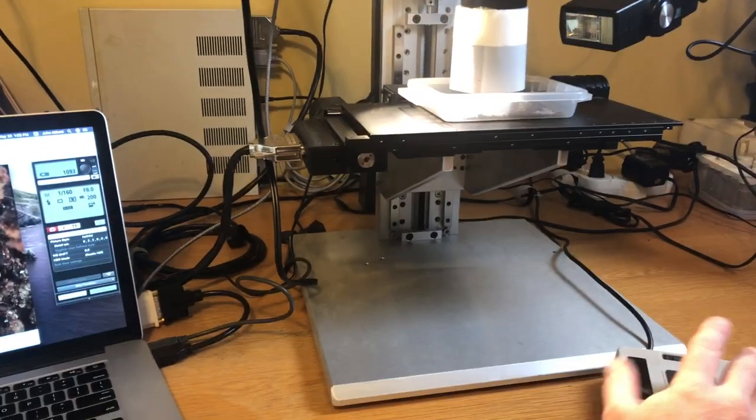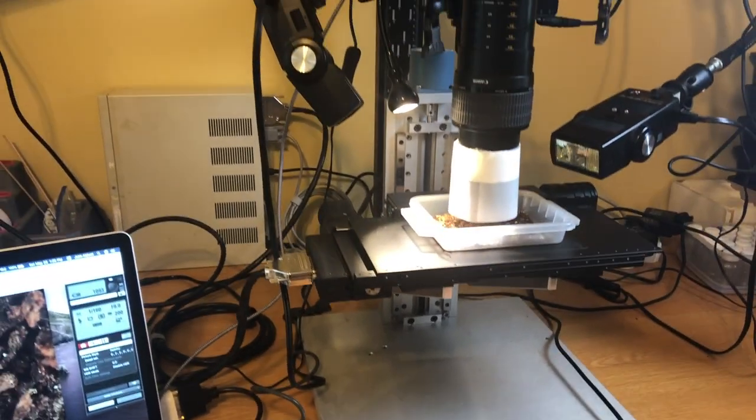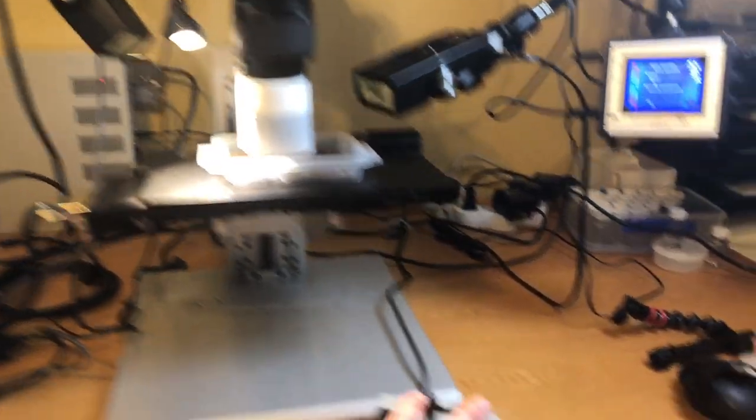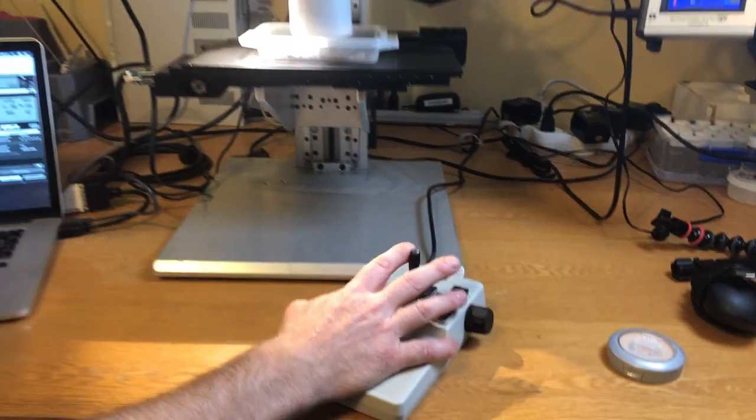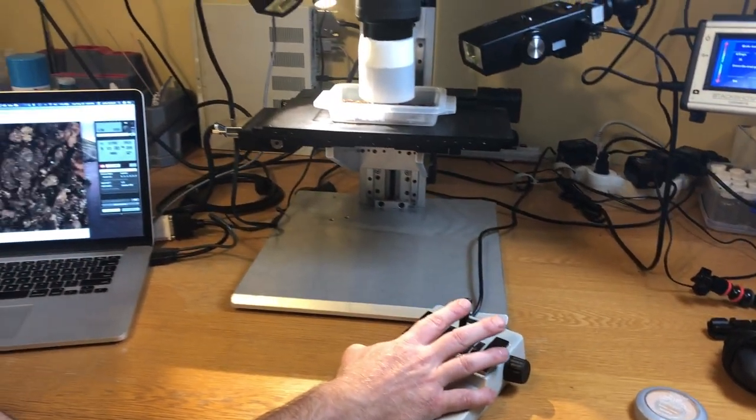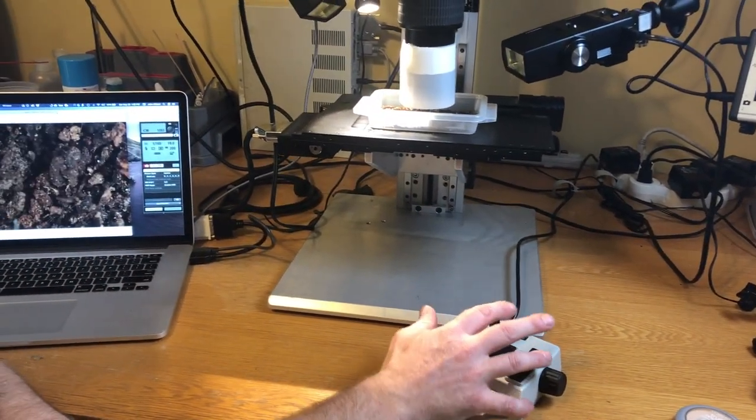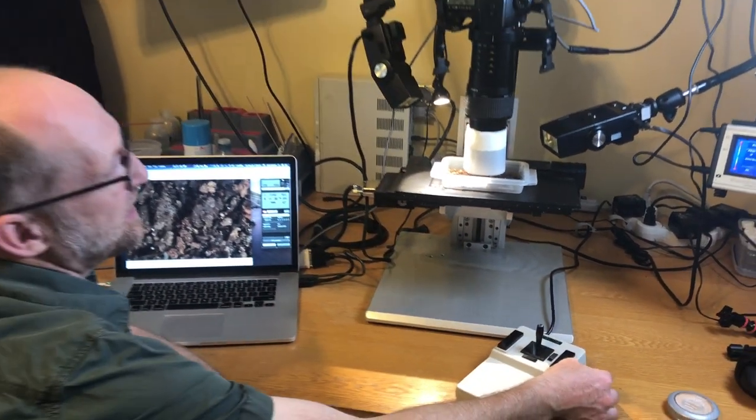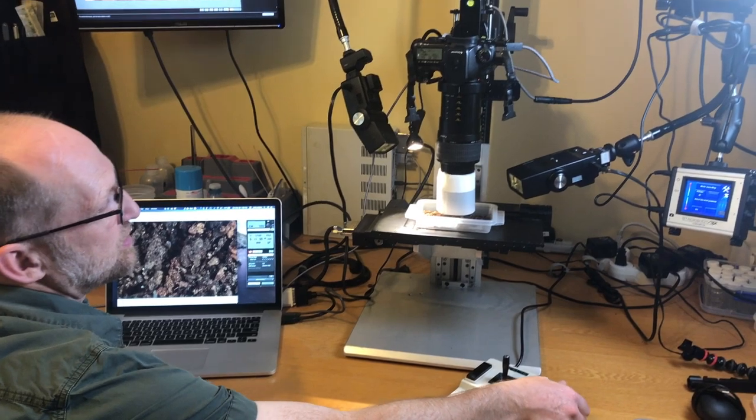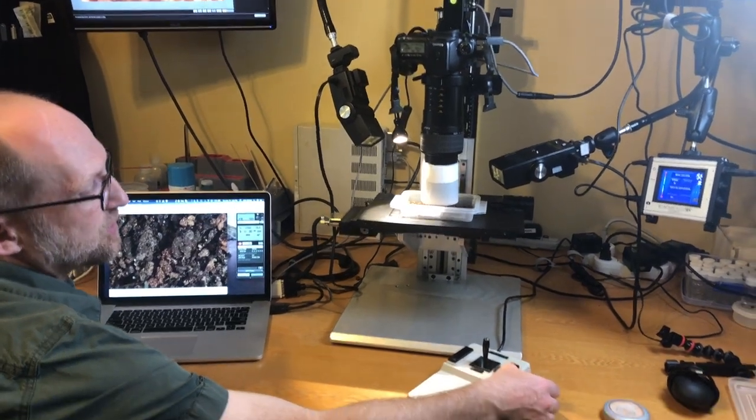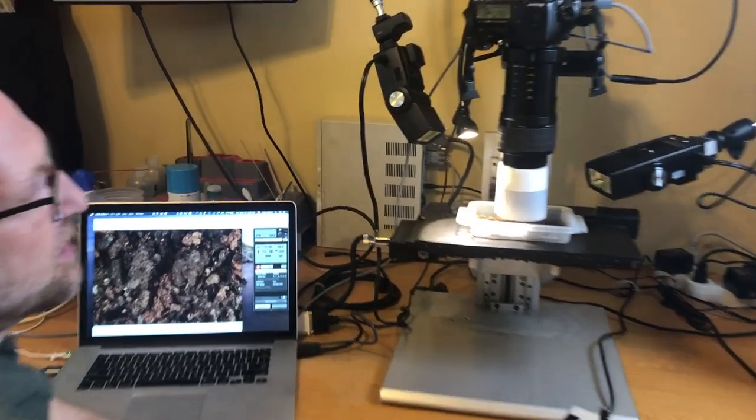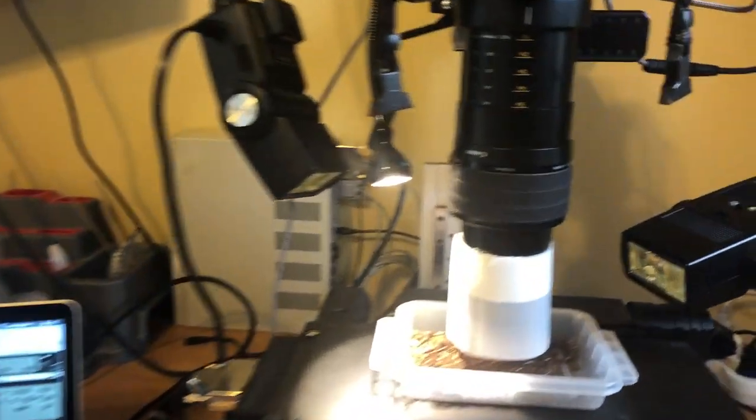With the joystick, I can move the stage around XY. I can also move it up and down to fine focus with the knob here to the Z axis.